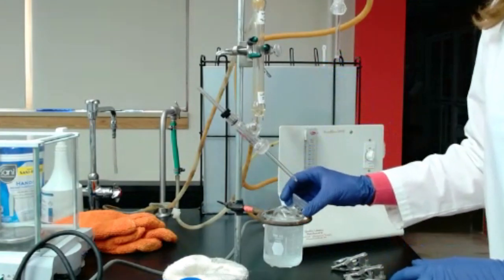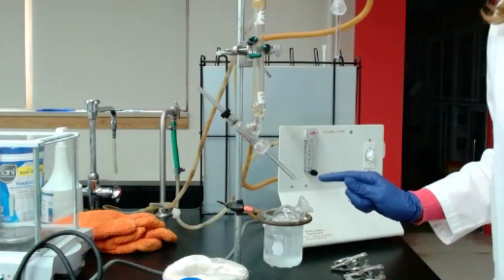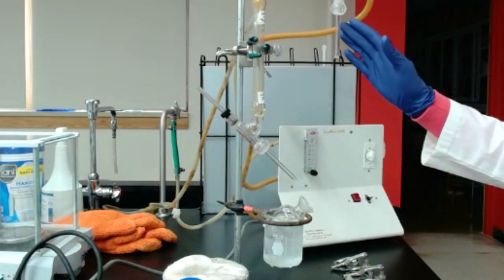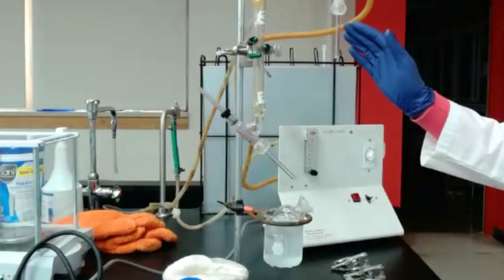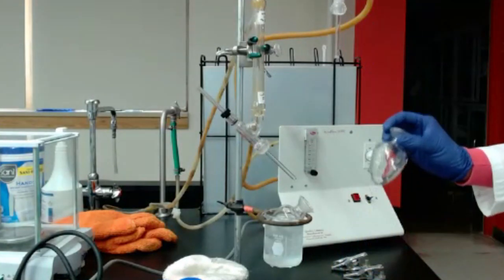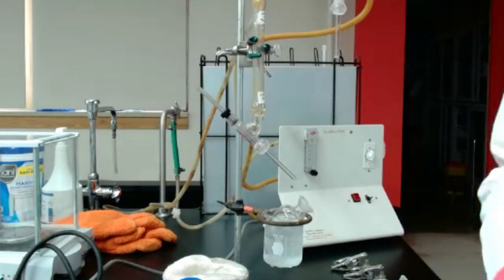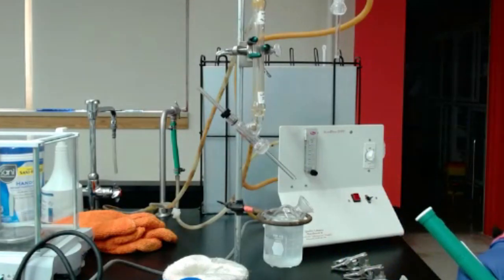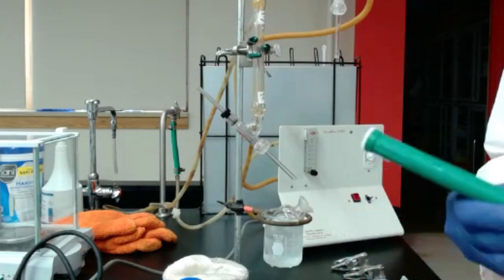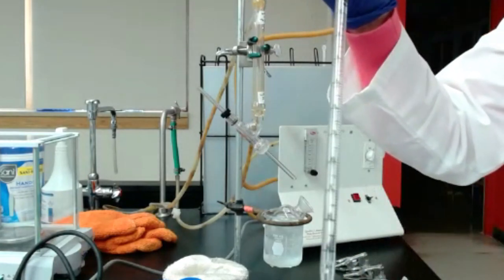In this flask, that's where we're going to have the wine. In the other flask, that's where we're going to have the hydrogen peroxide solution. So let's start with the hydrogen peroxide solution in the other flask. To do so, we need to take hydrogen peroxide. So use a pipette. You will need to take 10 milliliters. So use that pipette of 10 milliliters.